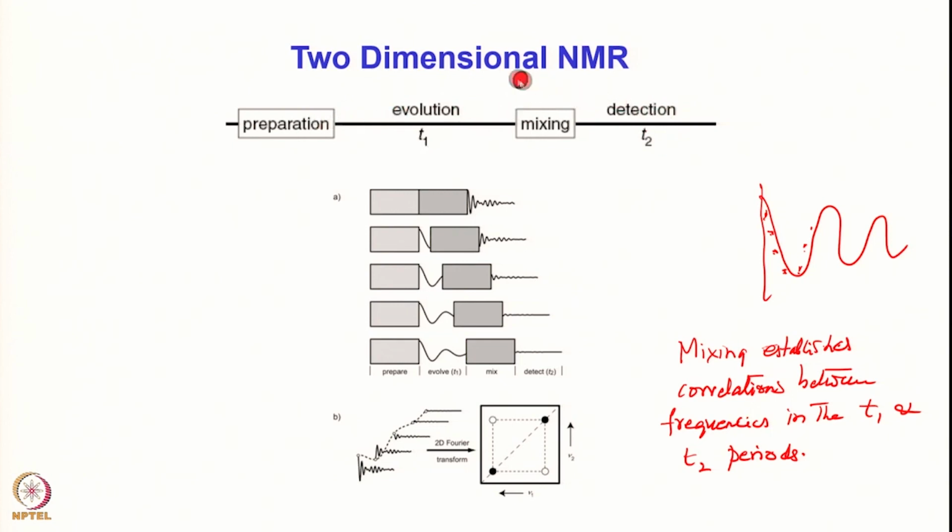Okay. And the transfer may go 100% or it may go 50% or whatever. So depending upon the way the mixing is done, you have a partial transfer or full transfer. This is what happened in the case of NOE, for example. In NOE, the entire magnetization is not going there; part of the magnetization, part of the perturbation, is getting transferred to another spin, and therefore that spin will carry the information of the past. So this is the idea.